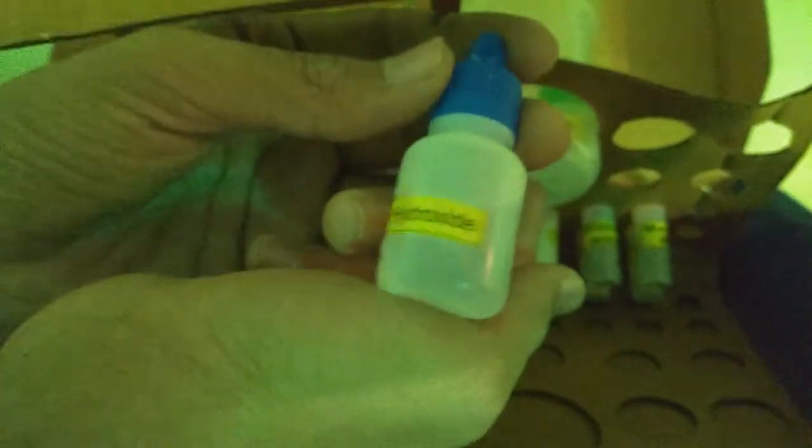Phenolphthalein. Formaldehyde. Microburner. Sodium hydroxide, nitric acid, hydroxide.